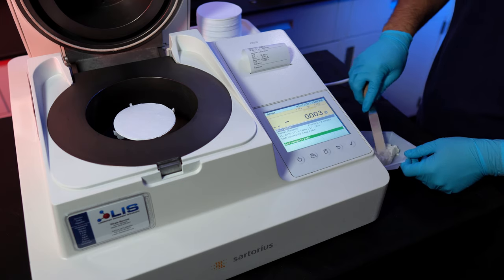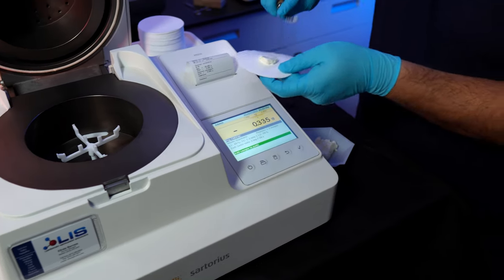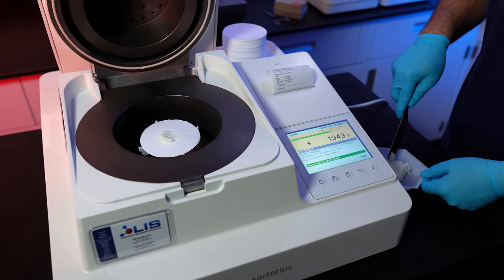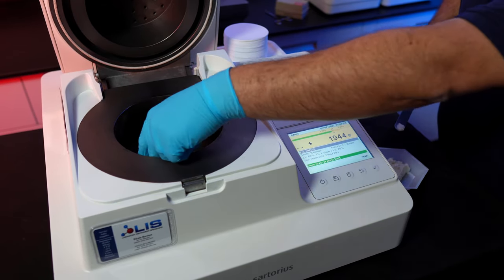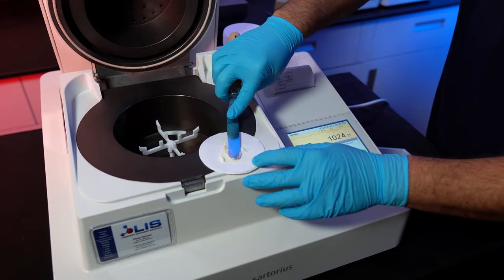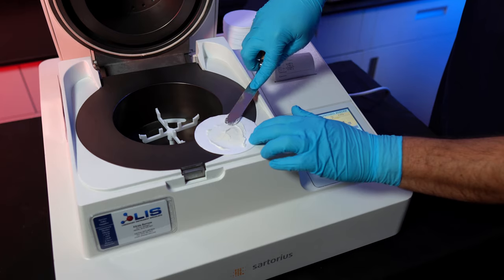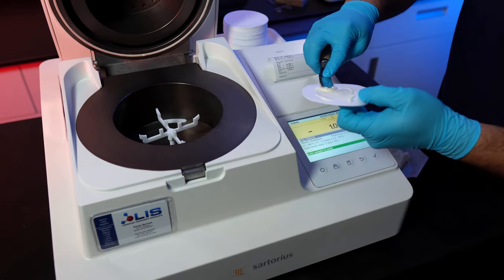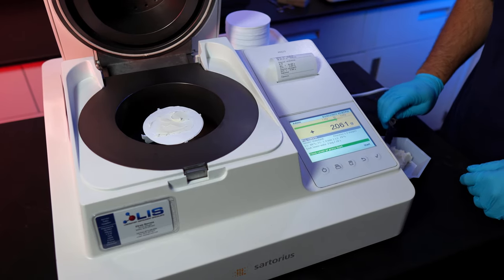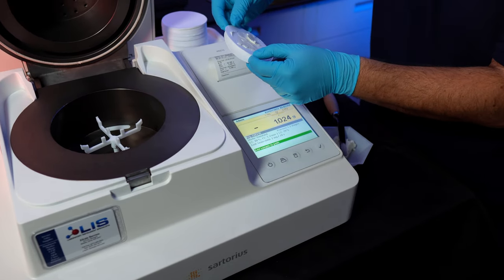Now apply the sample. We want to only apply around 2 grams of weight. Once the sample weight is correct, spread the sample evenly throughout the sample pad so you can get the most accurate test results. Place the sample back on to confirm the weight is still correct. Once correct, use the bottom pad and place it on top of the other like a sandwich.